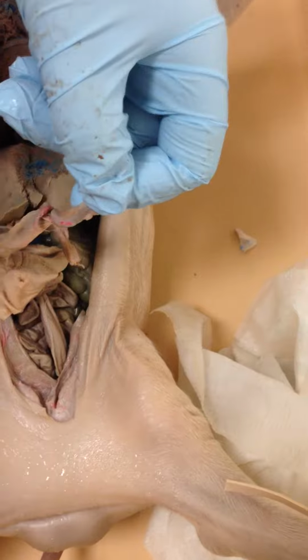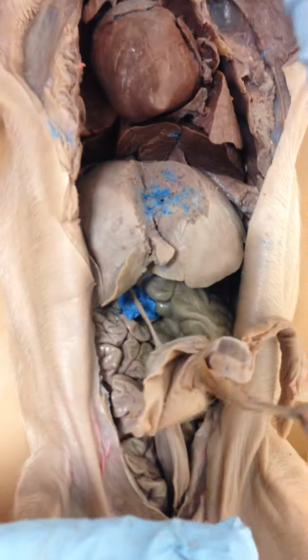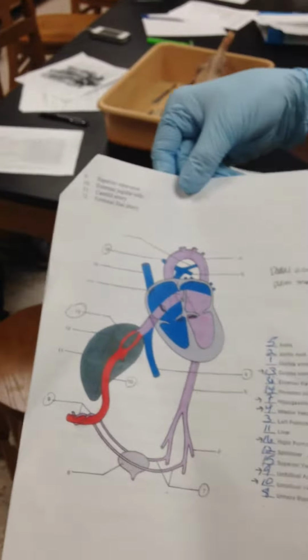Then the umbilical vein. This one right here, going right to the umbilicus. The dorsal aorta. Well, can we see it? No. You can't see it on there. And it's not labeled.